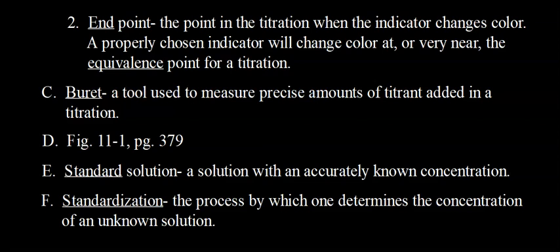It's kind of hard to tell from the picture if we can do half of the smallest division on this device or not. So I'm going to accept a couple things there. I'm going to record that as 5.4 milliliters. So it just looks to be just right above that fourth line under the 5. So again, we're reading from top to bottom. So 5.4. If we do half of the smallest division, that's between the third and fourth line after the 5.